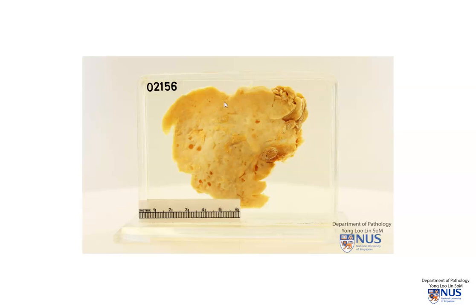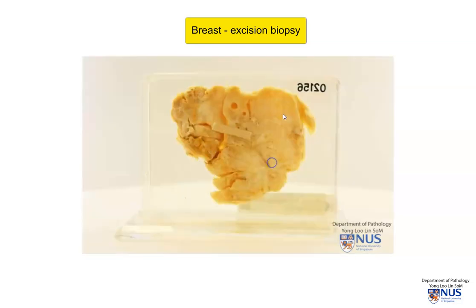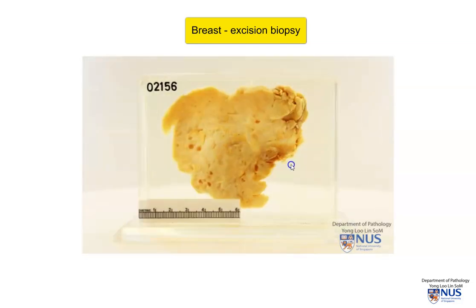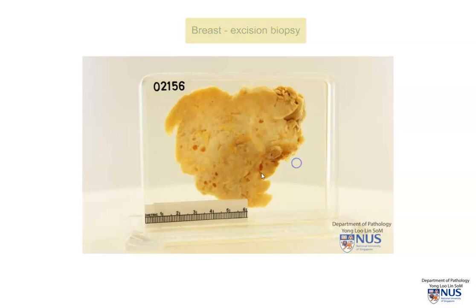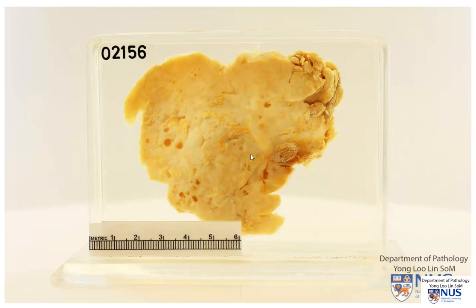Hello, this is a gross pathology specimen taken from a breast. What we're looking at is the cut surface, and we can actually recognize some fatty tissue here and here, which are the yellowish areas.